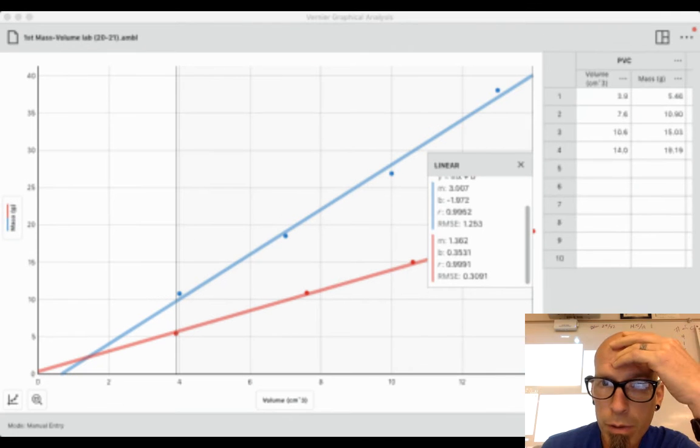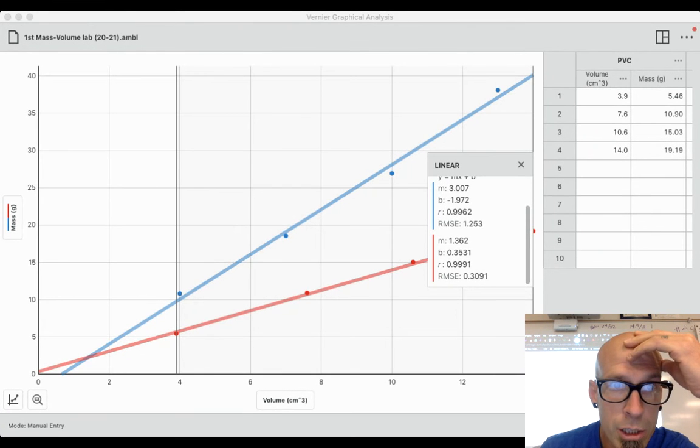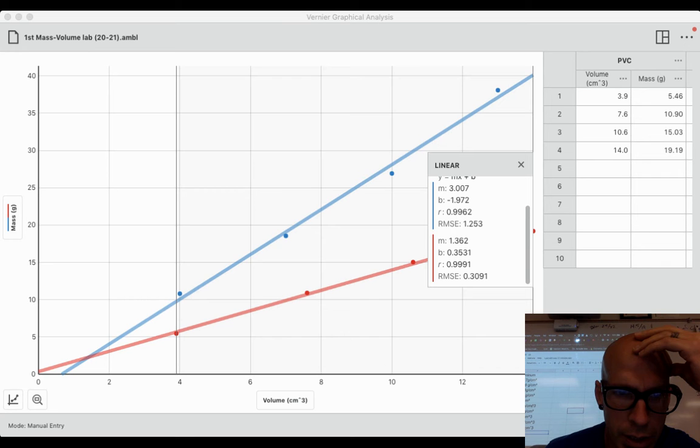Now, I want you to look at first period's numbers. I know not all of you are in first period. Some of you obviously are in different class periods. But this is the spreadsheet we had for first period. So if you look at these, except for groups 1 and 2, these are all really close to the same. We all are like 1.3 something, like upper 1.3s, and then 1.43. So very close to 1.373839, somewhere in that range.